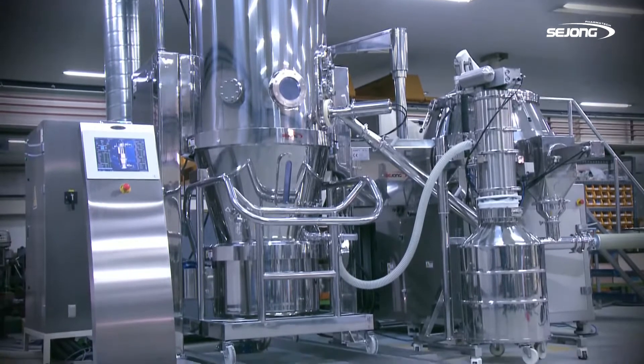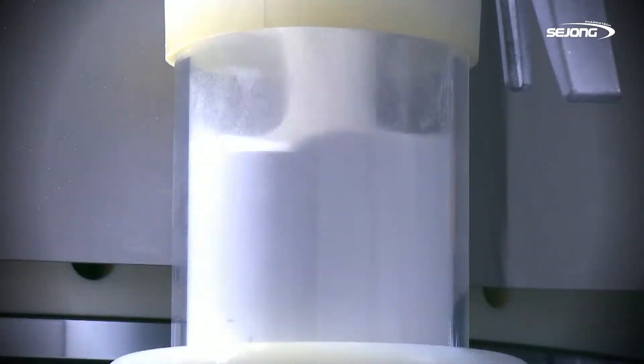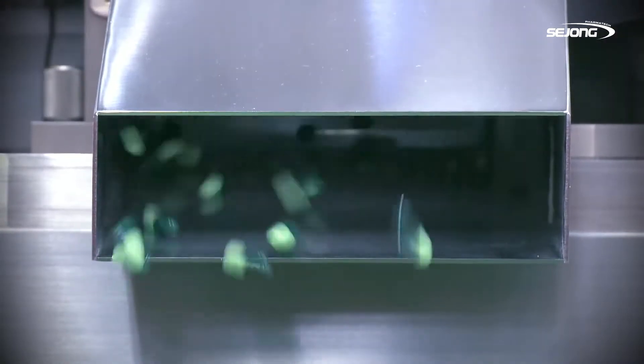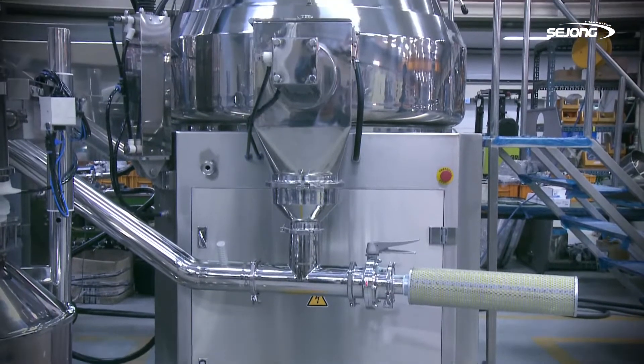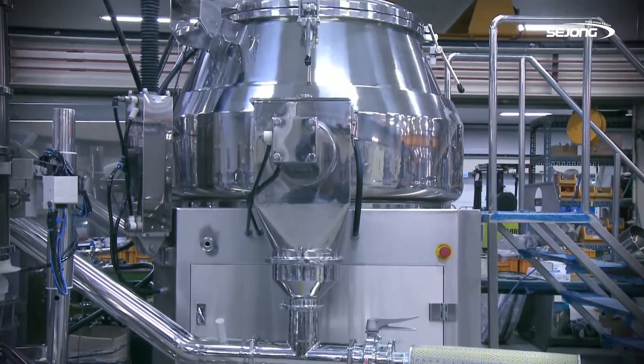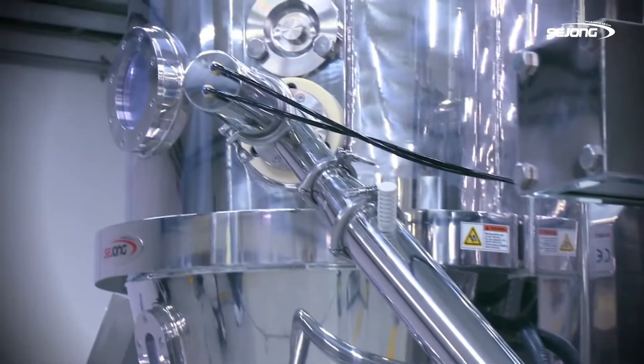Sejong PharmaTech newly presents the Fluid Bed System, D-Series. It is the necessary production facility for powder fluid. D-Series will suggest wider solutions to the powder fluid production process when it is linked to the high-speed mixer of Sejong PharmaTech.